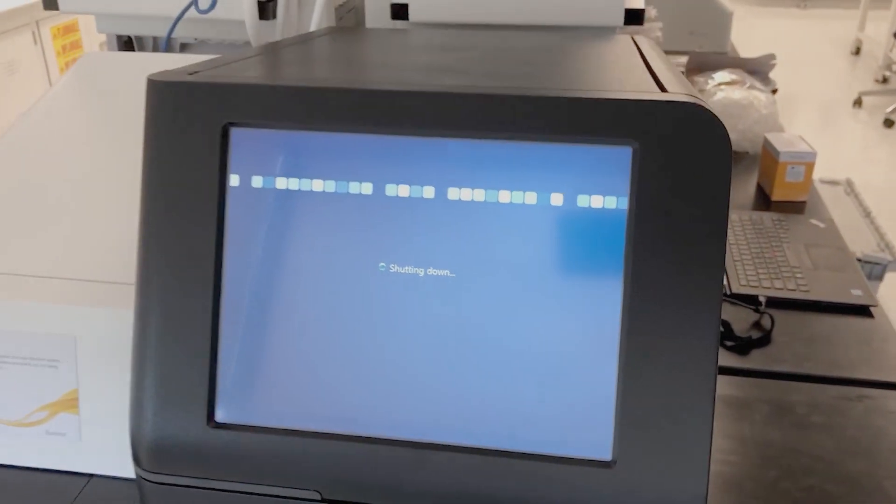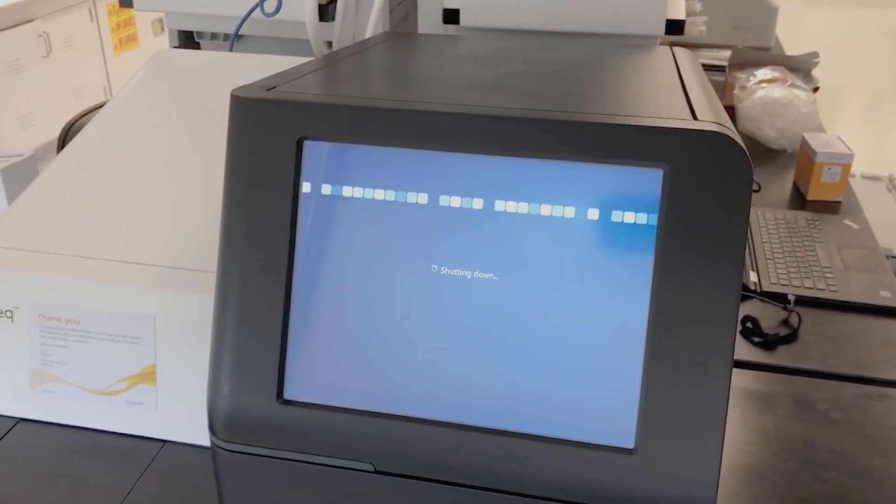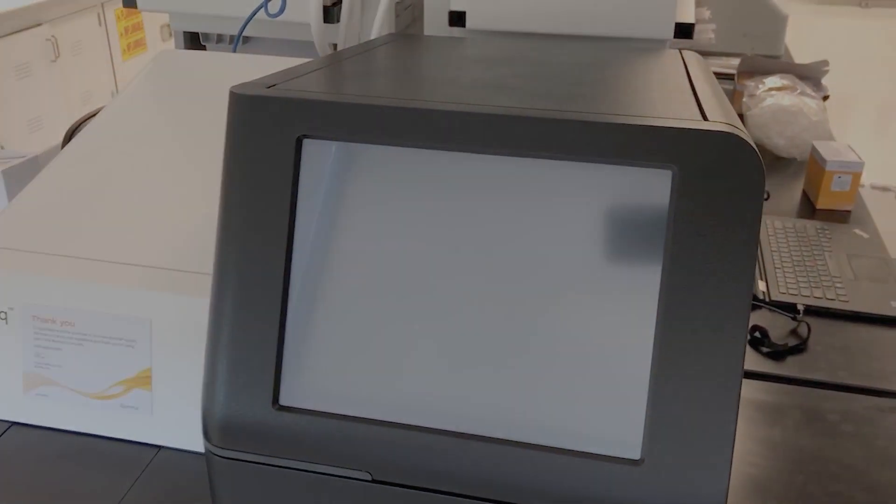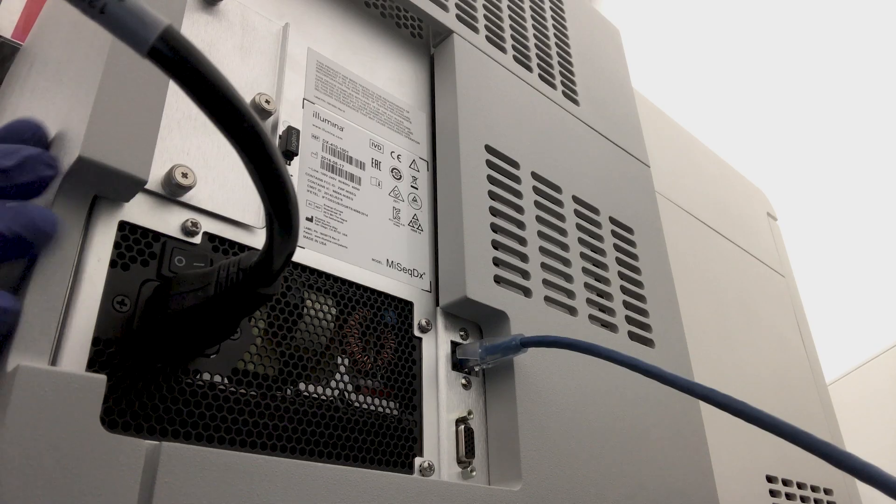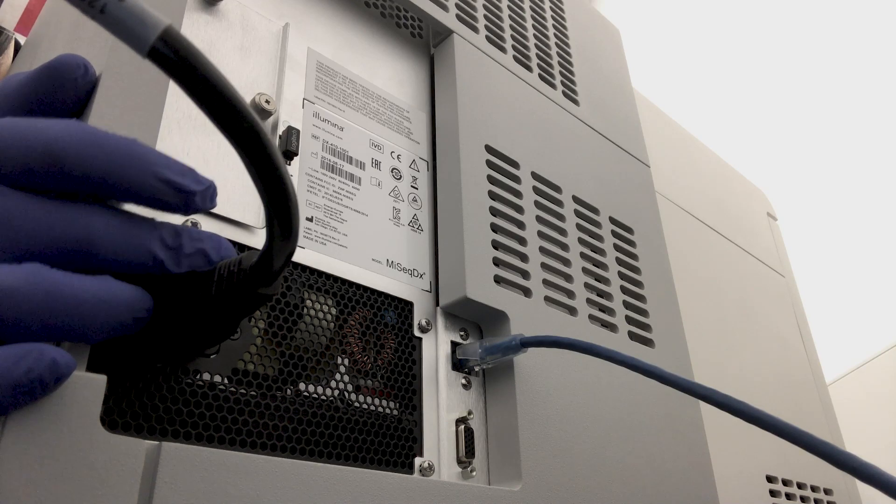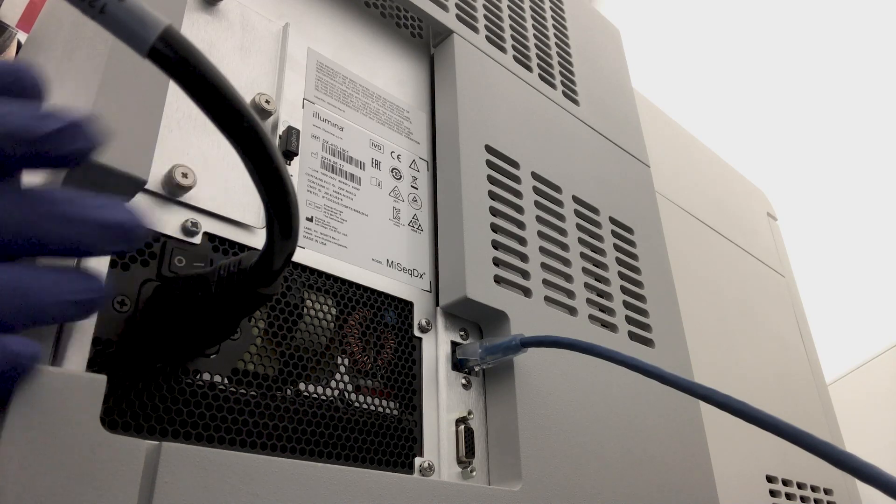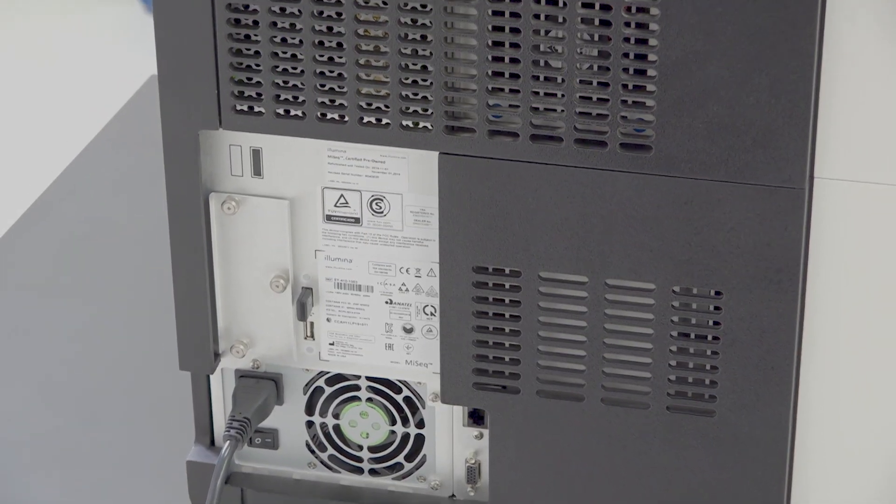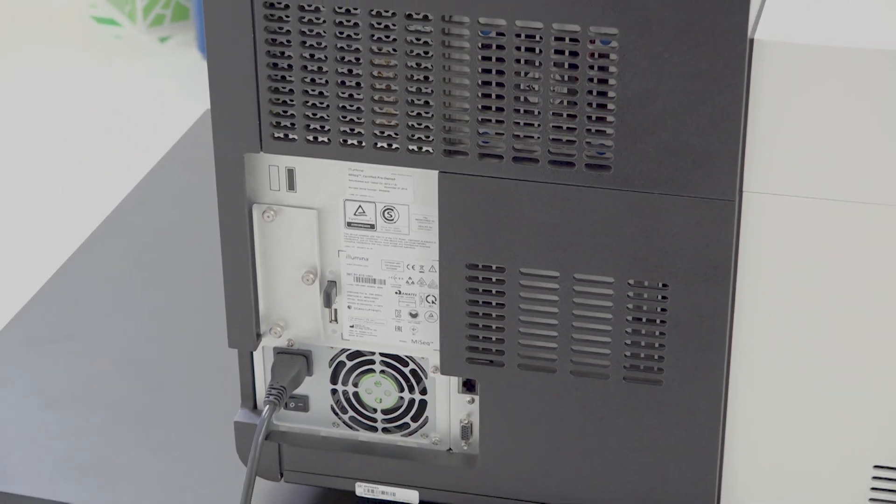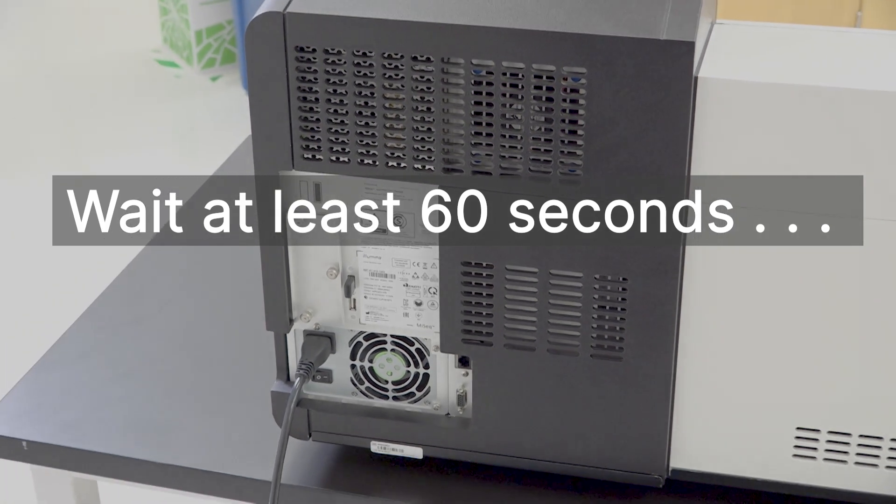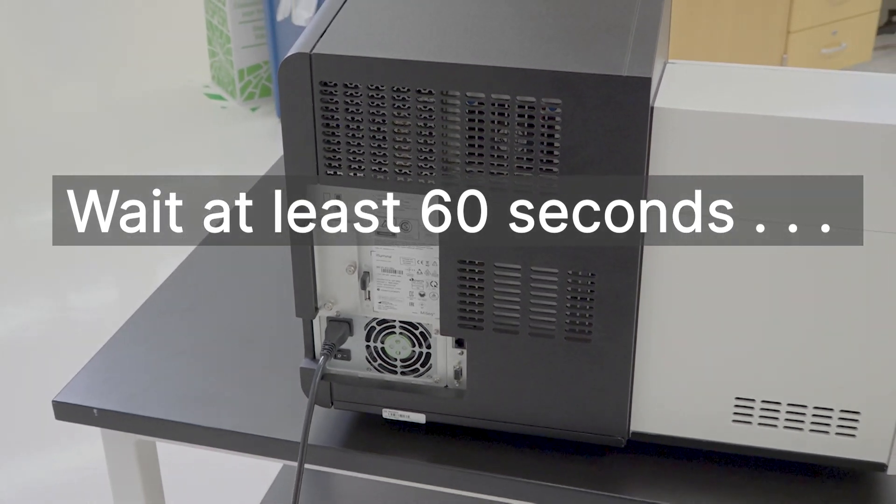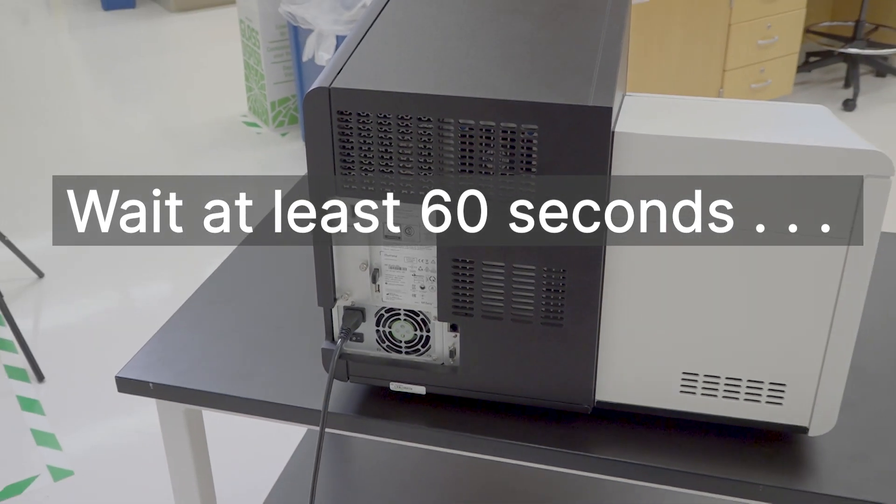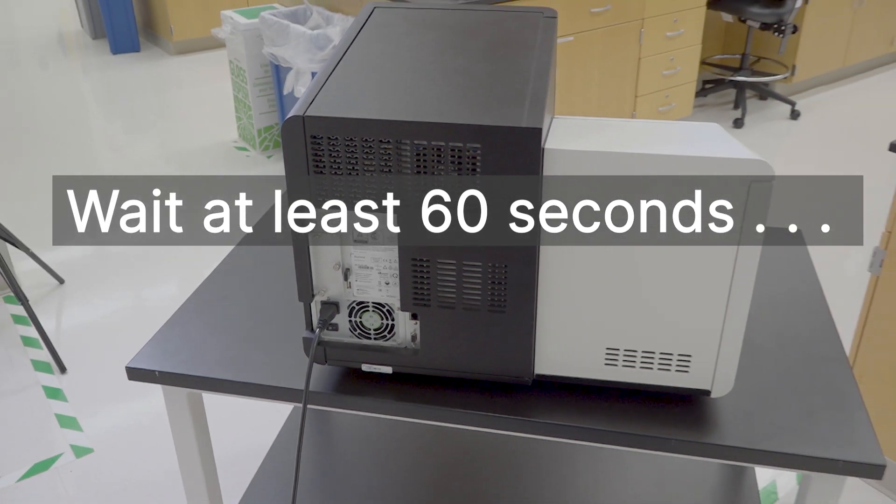After the instrument computer has shut down, use the power switch at the back of the MySeq to turn the instrument off. Wait at least 60 seconds. We recommend leaving the instrument off for three minutes.